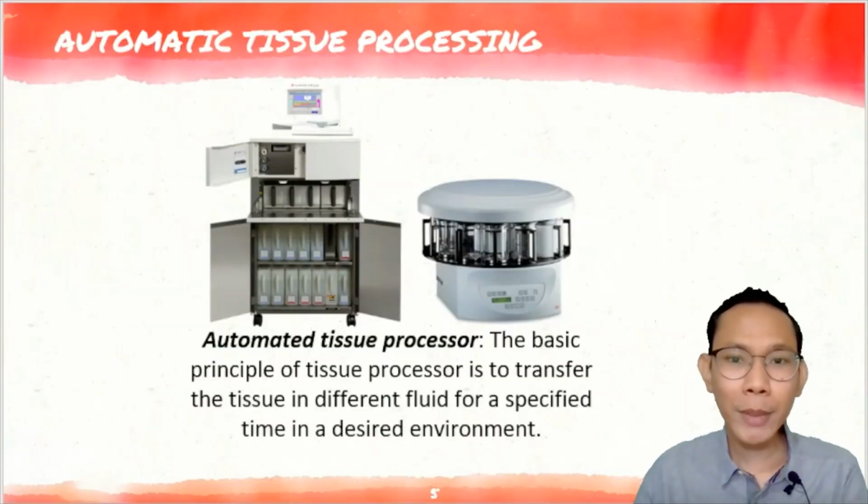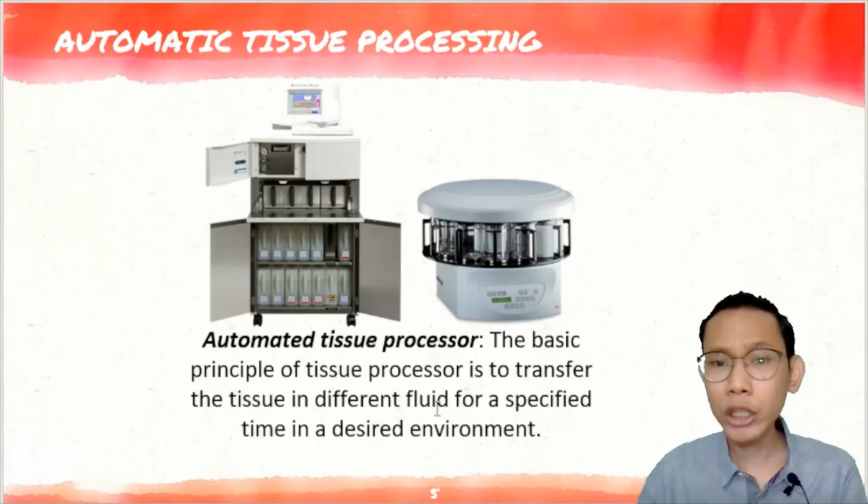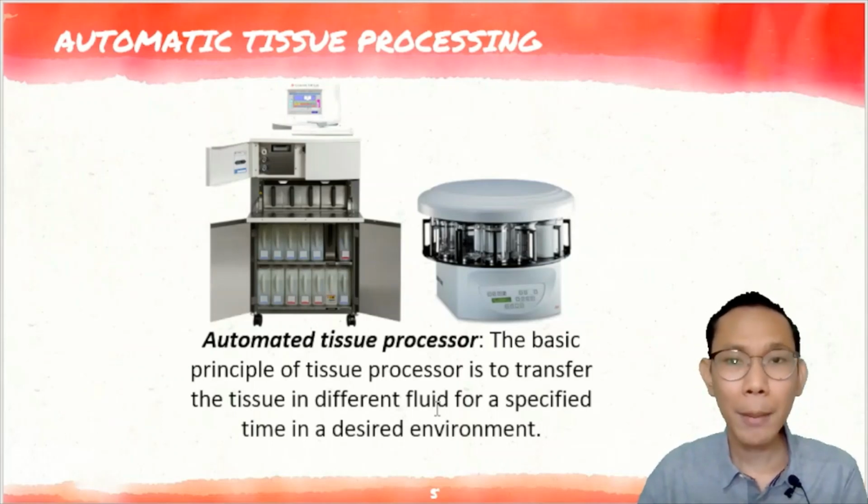So for automatic tissue processing, ano po ang principle nito, Doc? The basic principle is just to transfer the tissue in different fluids for a specified time in a desired environment. Remember that tissue processing can be performed manually. So yung tinatawag natin na hand processing.